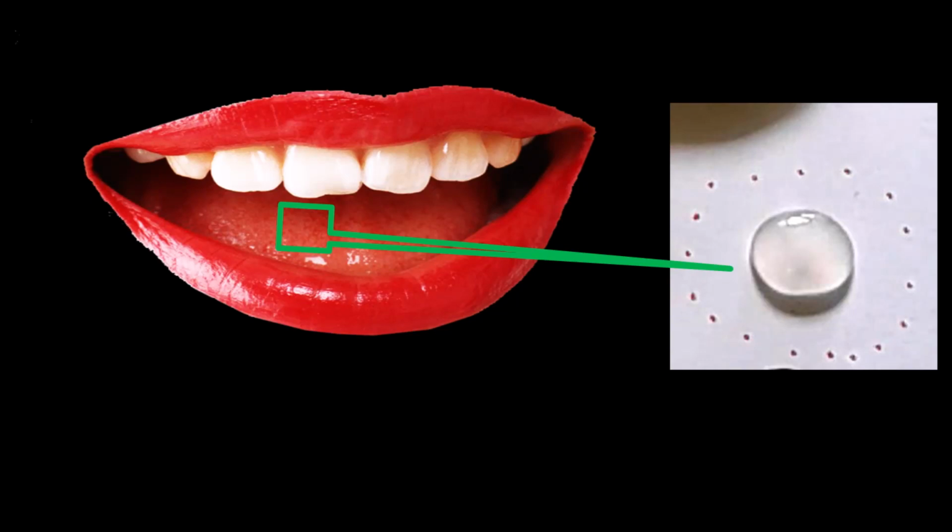In this video, we will know the role of saliva in digestion. Also, we will watch its live digestive action.